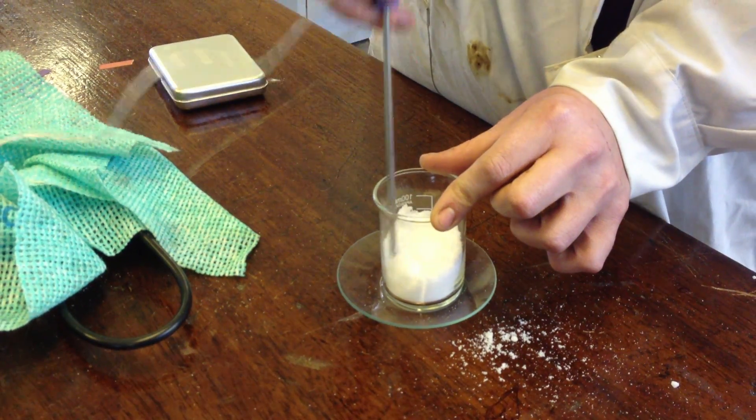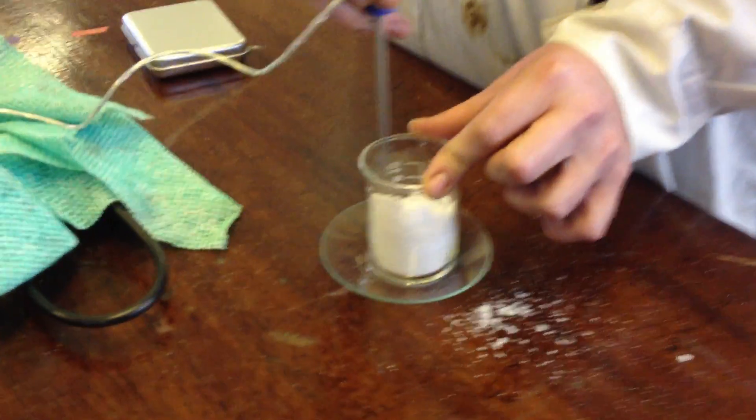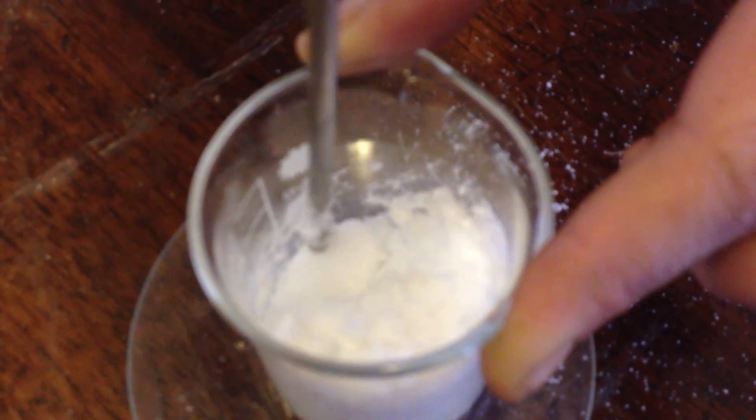Almost instantly you can see that their state is changing slightly. They're almost clumping together and making almost like a paste. I should bring down some of these lumps.